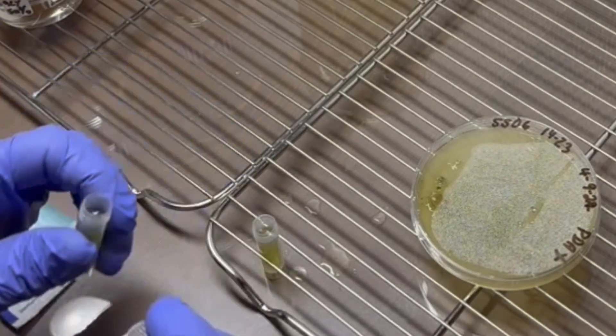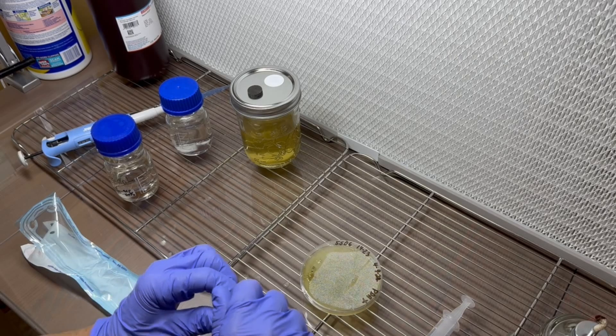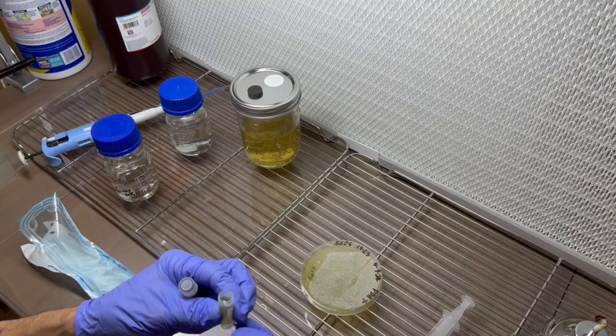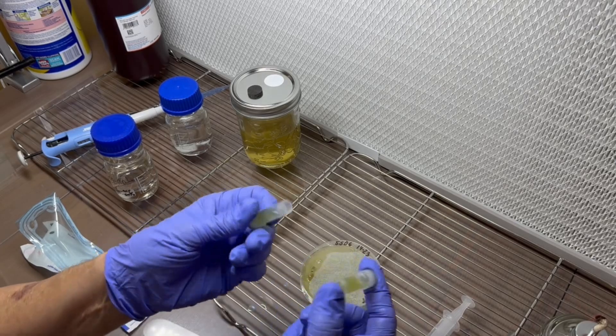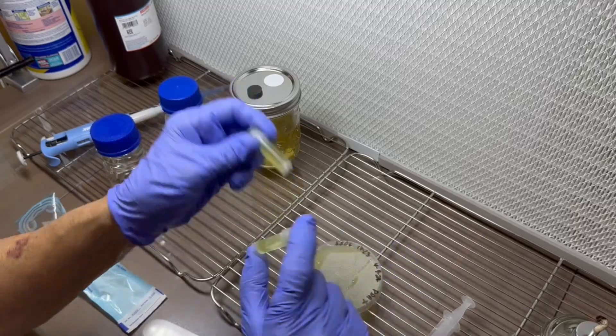Now this will go in the refrigerator inside a jar, and you can establish new plates with just a drop of these — or even less, just a tiny little bit.